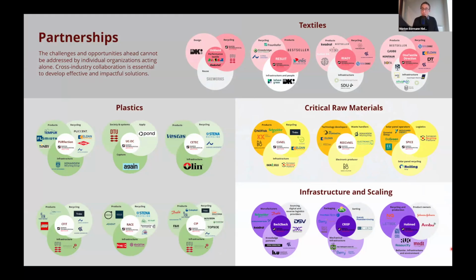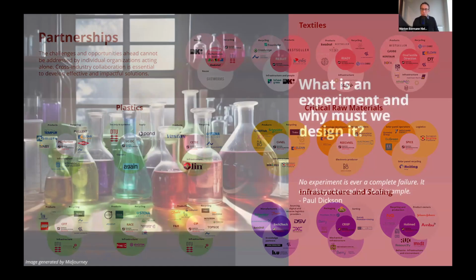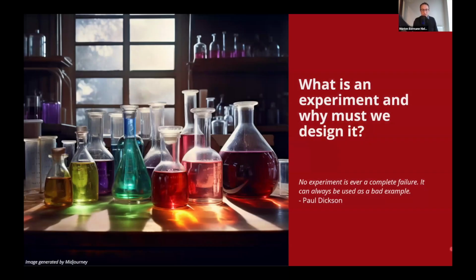And in a lot of these, we have to improve processes and or products using experiments. And that's where tools like Bayesian optimization come in. Bayesian optimization is an experimental design method. And so for the people who might not be familiar with it, it's good to put it in the context of broad experimental design, and why it's a good idea in the first place to use tools such as this.